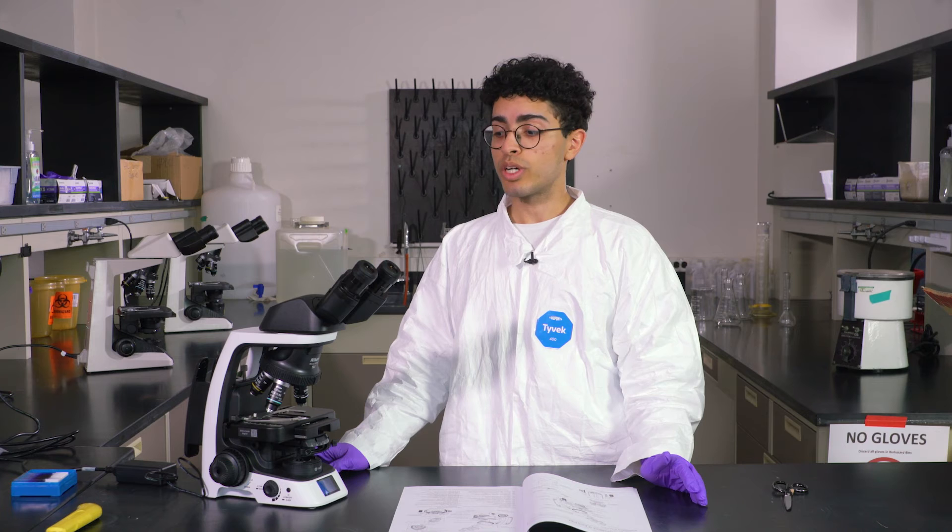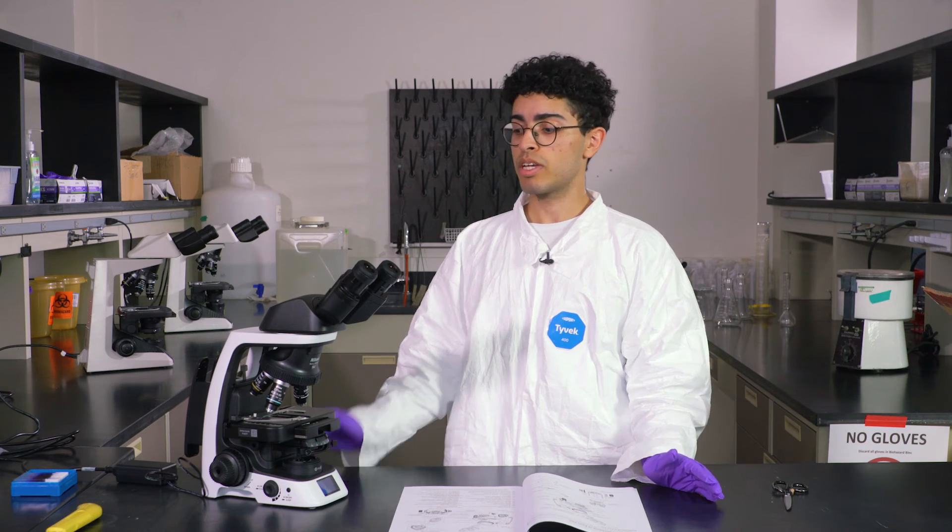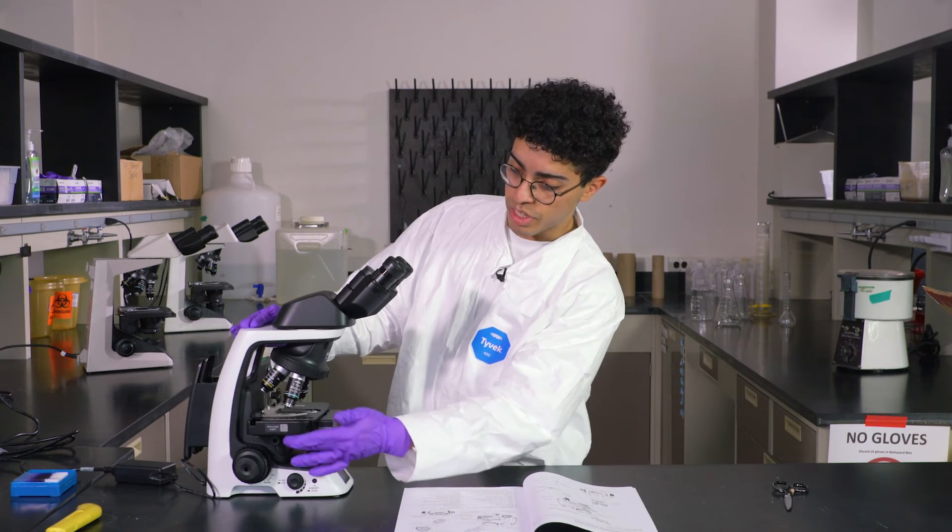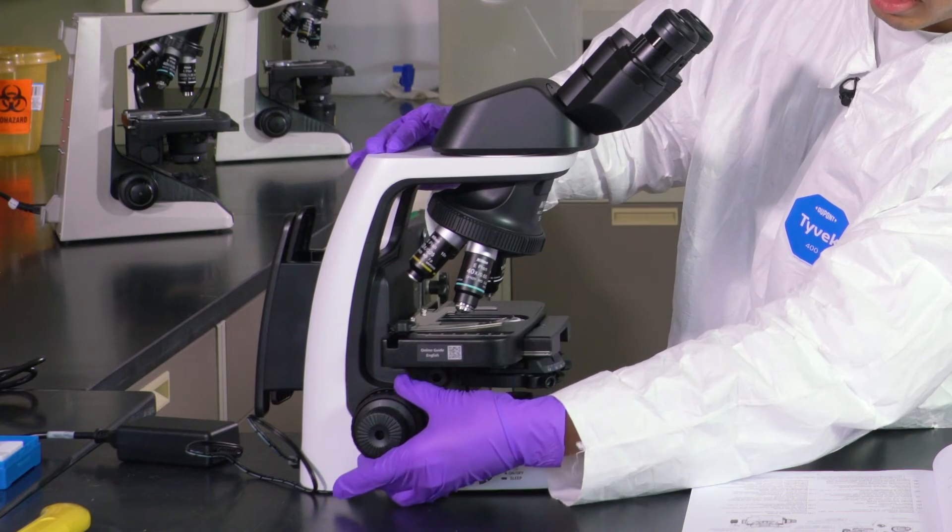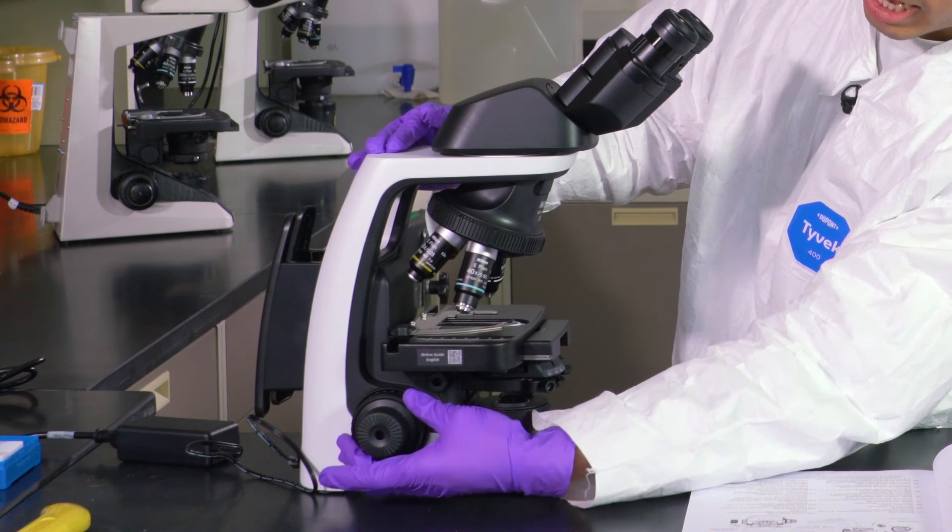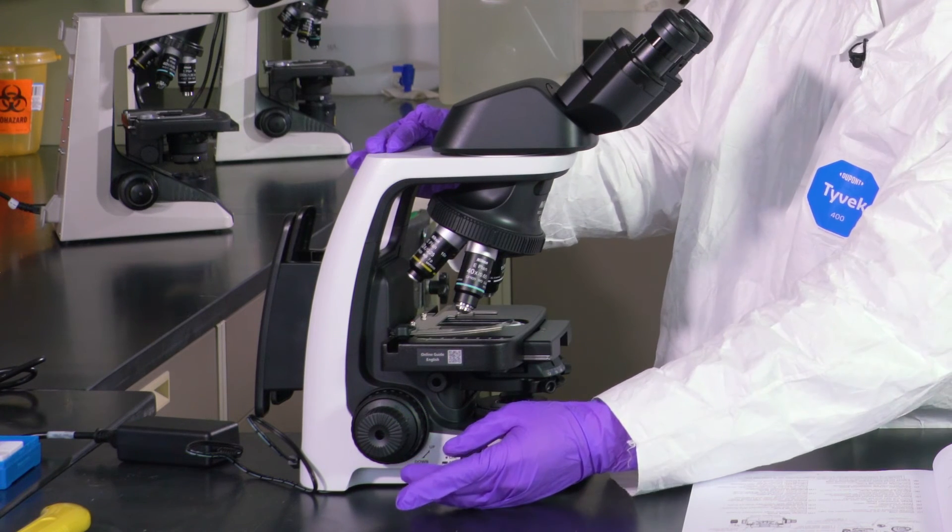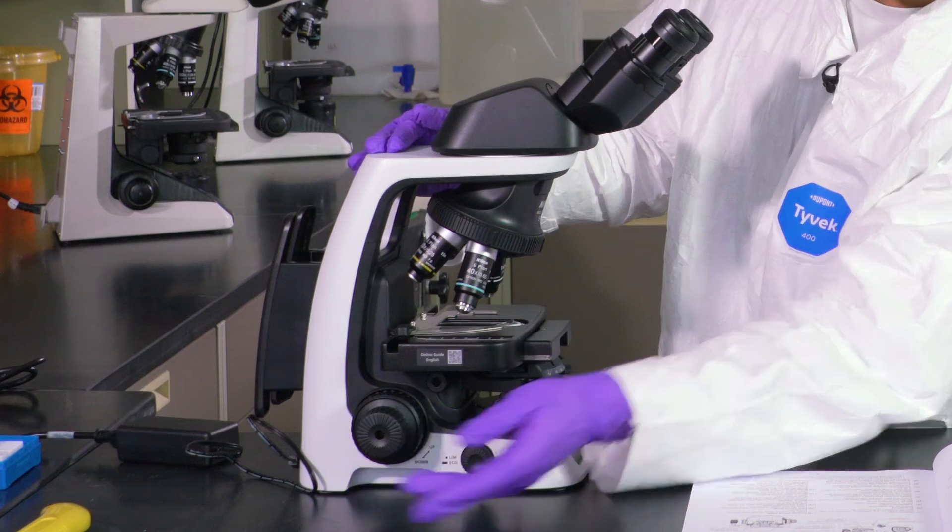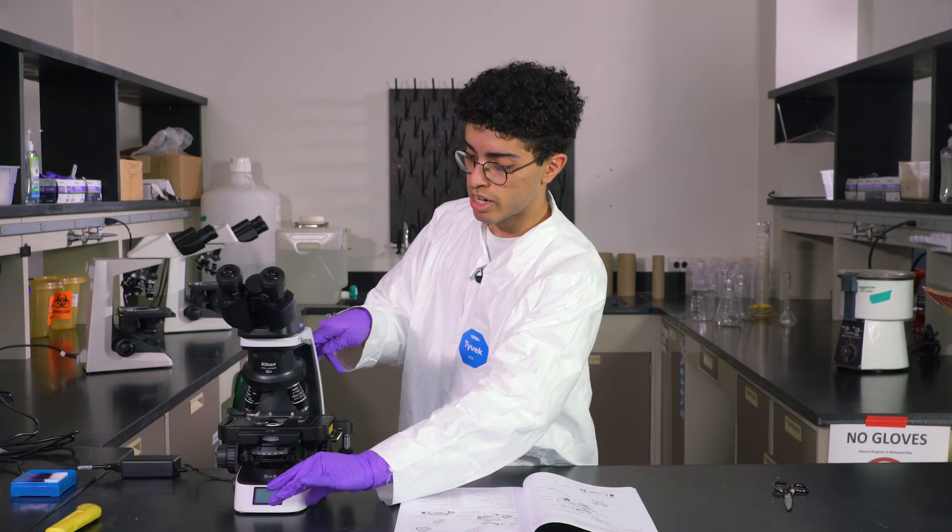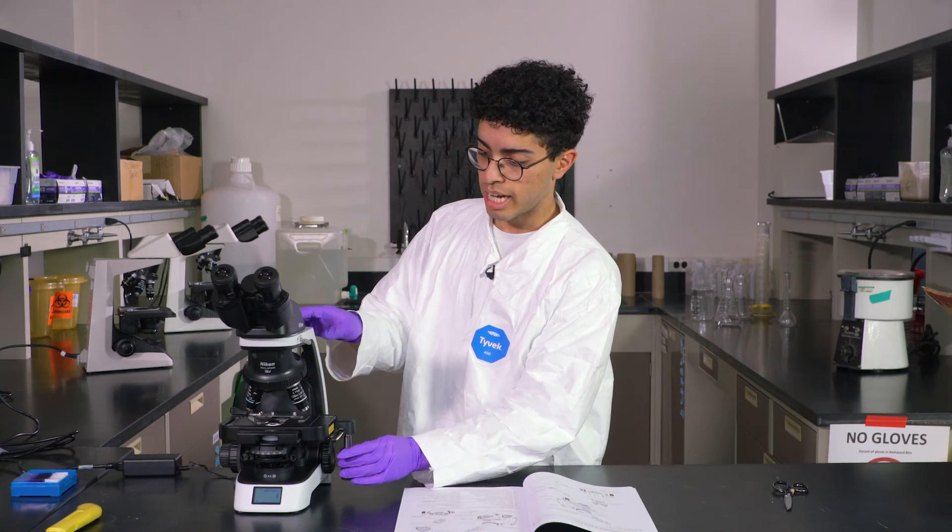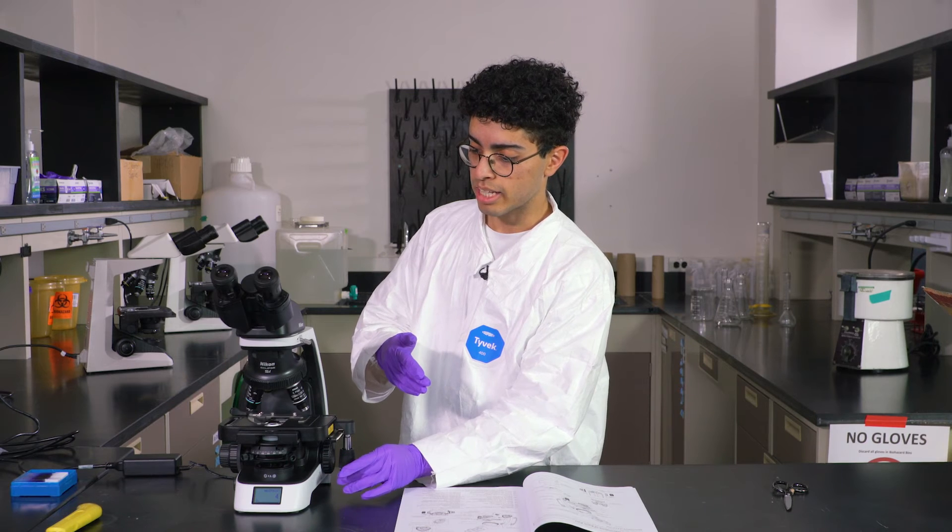So for gram staining, for example, in the microbiology courses, you do end up using all of them. This is the stage. It lifts and lowers with the slide. These are your adjusters, I guess. The coarse adjuster and the fine adjuster. And then over here, these get your slides to go up and back and left and right.